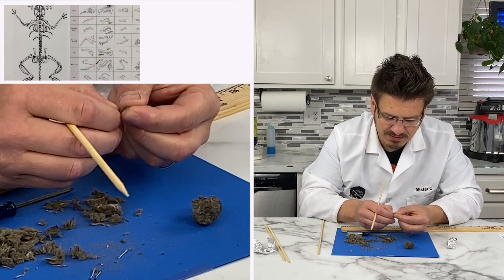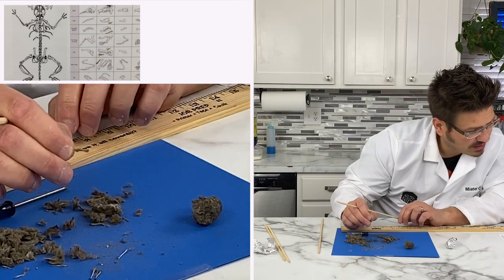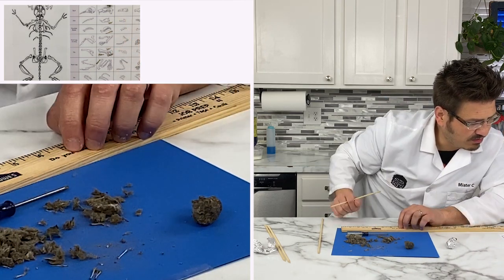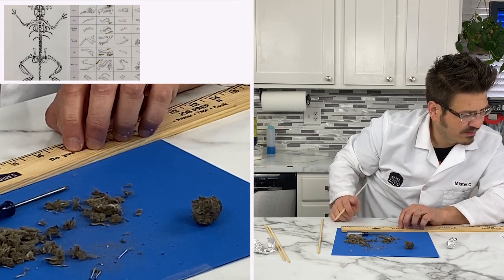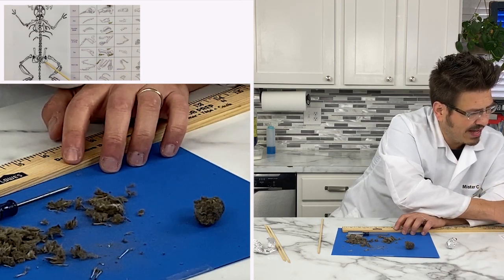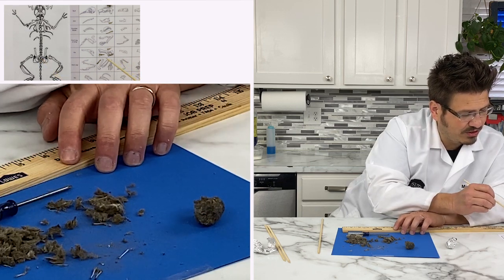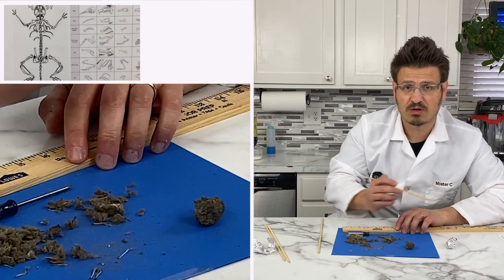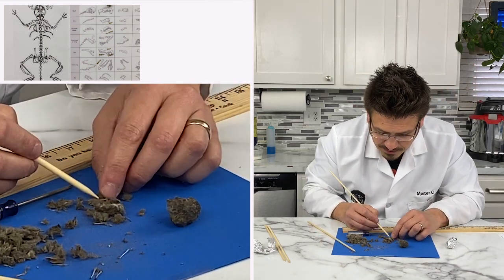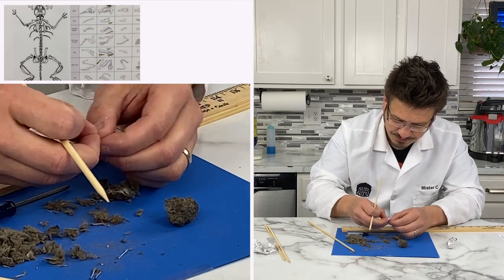And while I'm doing this, oh, what did I find? I think this could be a shoulder blade. No, this looks like a hip bone again. So we're finding multiple hip bones. If I'm looking at this mouse diagram over here, there's two hip bones, and I have more than two, and they're different sizes. So maybe there was more than one rodent in this pellet, in the gizzard of this owl.